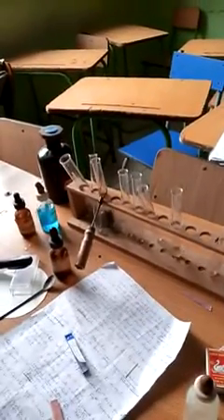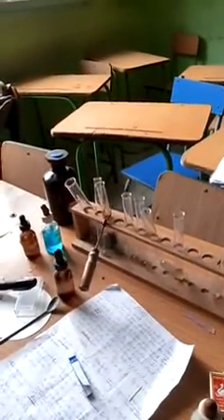So then I think the next one is C. What did they say we should read? Add a few drops of barium chloride to the second portion. So, in order for us to be very sure that this is barium chloride, should we dissolve a new one or use the one? The level has fallen off, but I know that it is barium chloride. So let's add barium chloride, even though the level has fallen off. They say a few drops, right? Yes, so let's add a few drops.